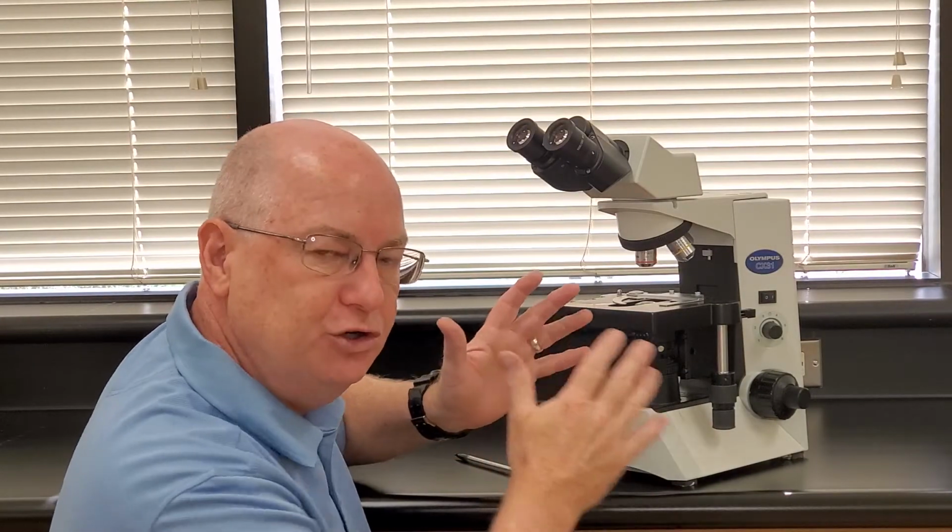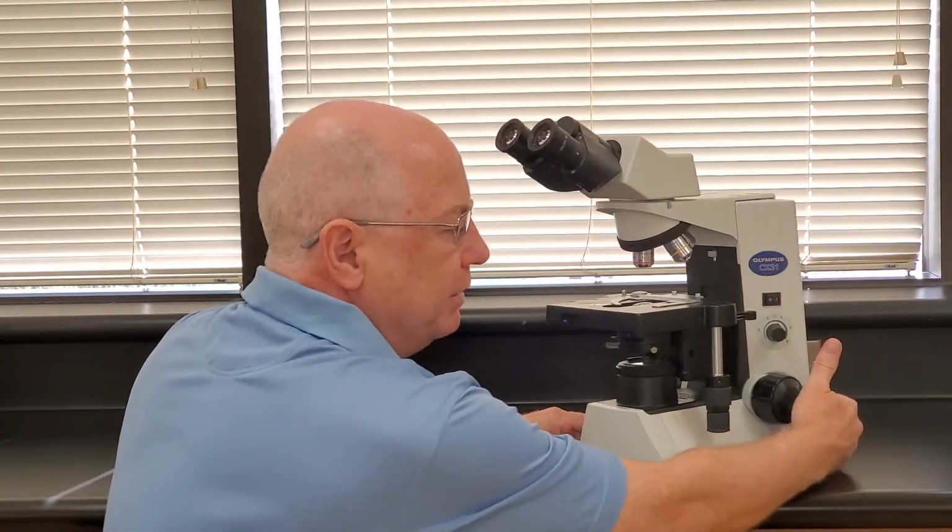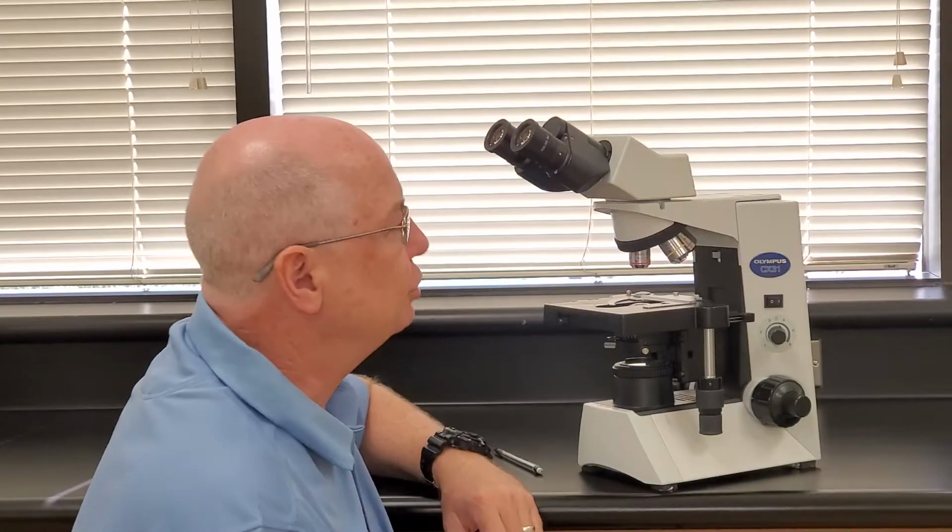Now, I know I've lost some of the continuity of what I was trying to get across, which are just the parts of the microscope, but I want you to understand how the microscope is used. So let me review the parts. I'm going to do the last couple of pieces, and then we'll finish up with the scope.